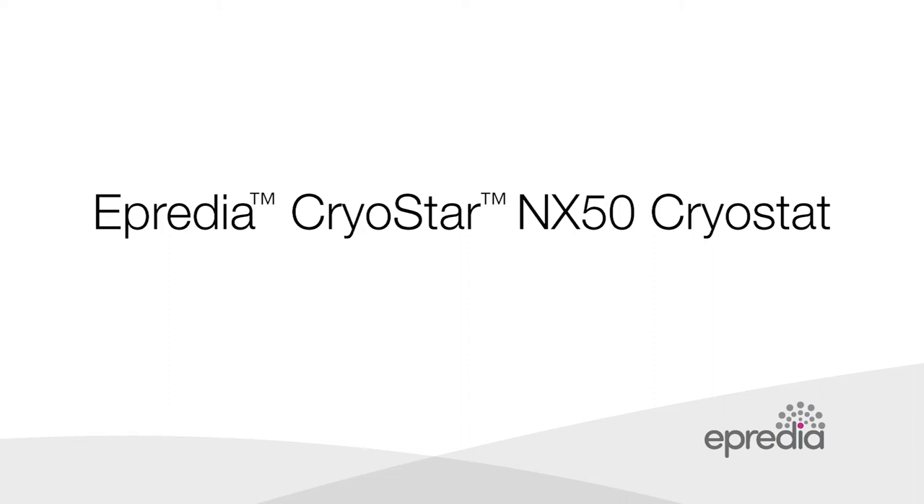The CryoStar NX50 from Epredia offers optimal sectioning quality paired with ergonomics and safety, and is designed to accommodate the needs of a routine clinical laboratory. In this video we will demonstrate the key features and value of the NX50 Cryostat.